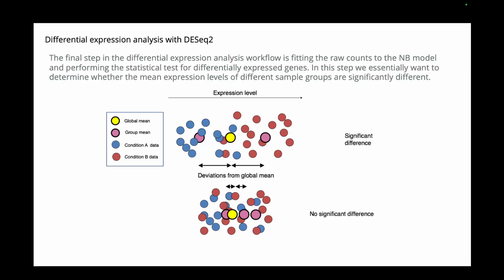Okay, now we'll look deeper into a particular tool used for differential expression analysis. We've seen the overview of what the caveats are and what you need to keep in mind for different things while comparing expression from RNA with different types of samples. Now, DESeq2 is one of the most popular tools for differential expression analysis.